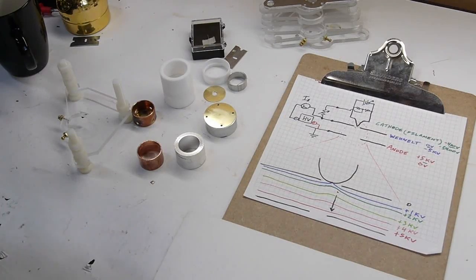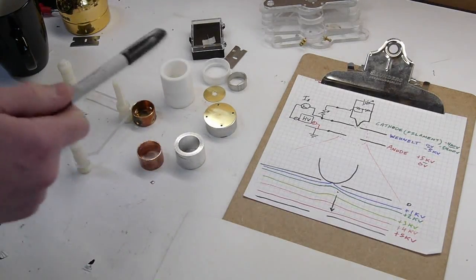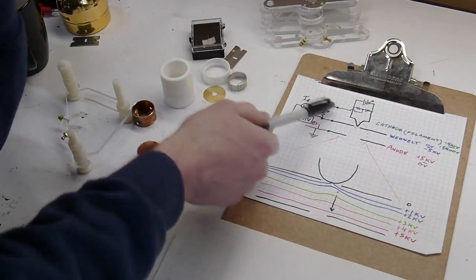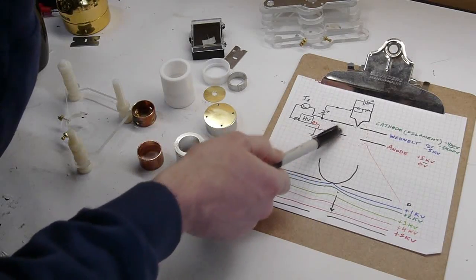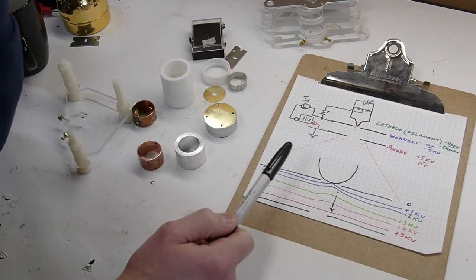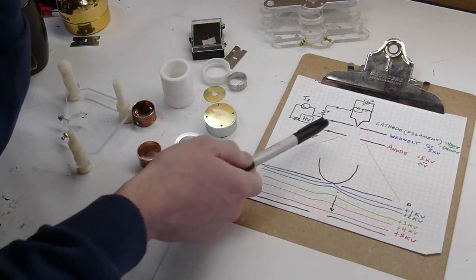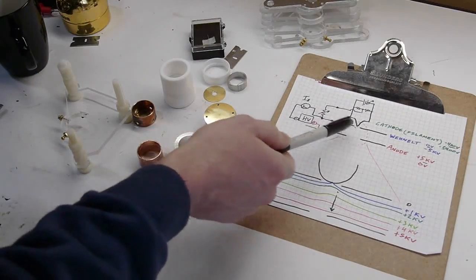So it's important not to think in terms of 'electrons are attracted to anodes.' It's really just an acceleration due to the field. So maybe we can talk about this control circuit here. So we know that if there's a big electric field between here, the electrons will be accelerated in a linear fashion. So what's the deal with all this, the Wenelt?